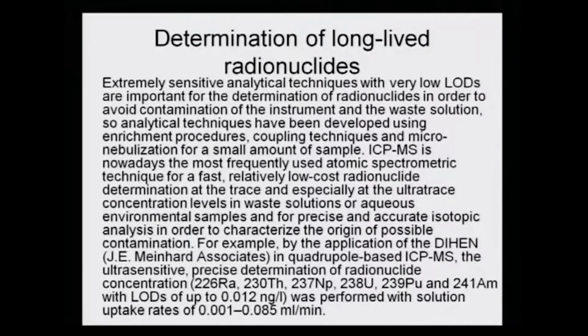Determination of long lived radionuclides. Extremely sensitive analytical techniques with very low limits of detection are important for the determination of radionuclides in order to avoid contamination of the instrument and the waste solution. So, analytical techniques have to be developed using enrichment procedures, coupling techniques and micro nebulization for a small amount of sample.